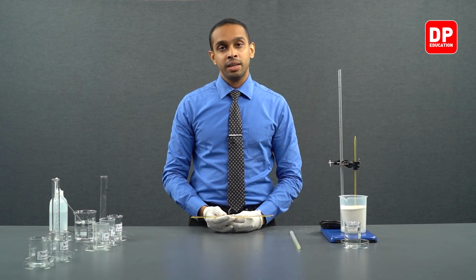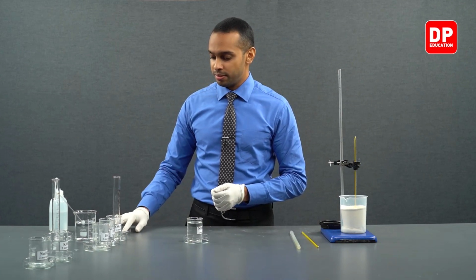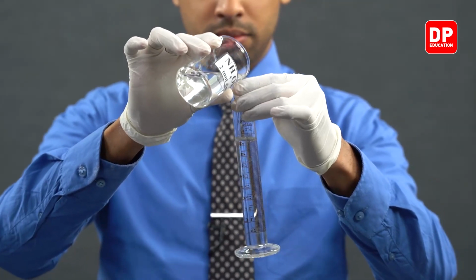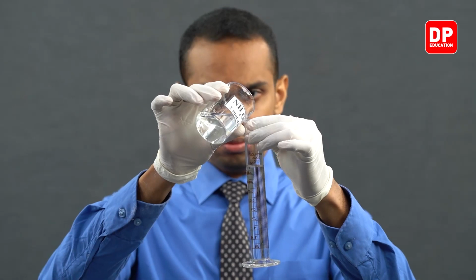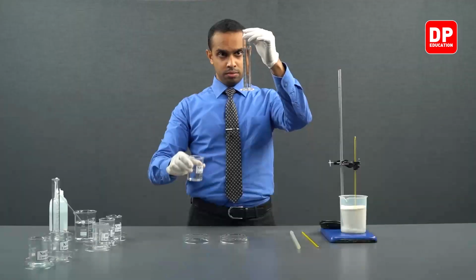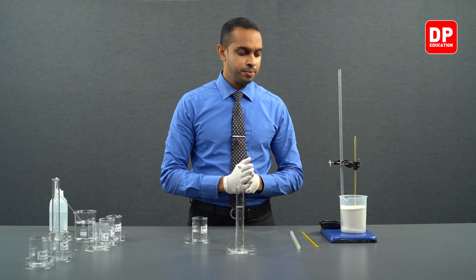Now, let's take a measuring cylinder and measure 50 milliliters of ammonium hydroxide. We have measured here 50 milliliters of ammonium hydroxide.